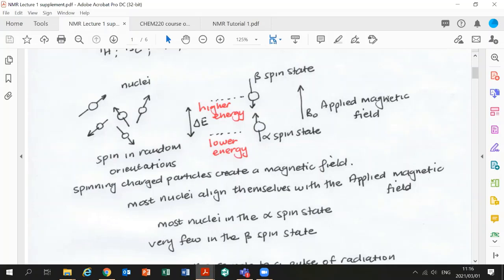So if we take this, we put it here, the protons can either be aligned with the magnetic field or opposite to the magnetic field, right? So how can you visualize this is look at a river. A river flows one way, right? And when the river flows one way and you throw something into the river, right, that is going to flow in the direction of the river, right? Going into the sea maybe, right? So whatever you put in there, it flows in the direction of the river, and it does flow in the direction of the river because that will require the least amount of energy.